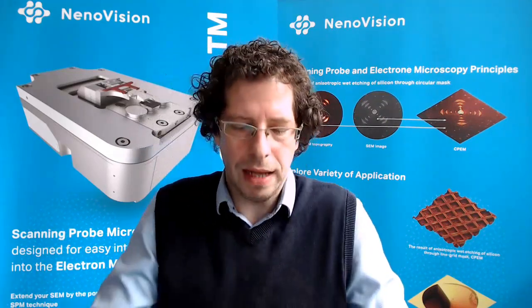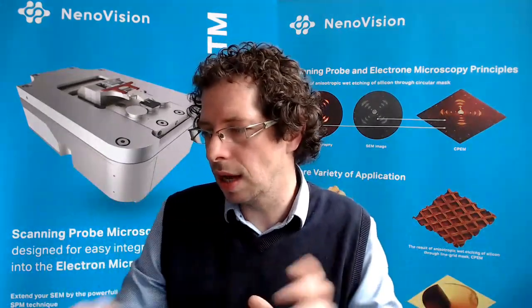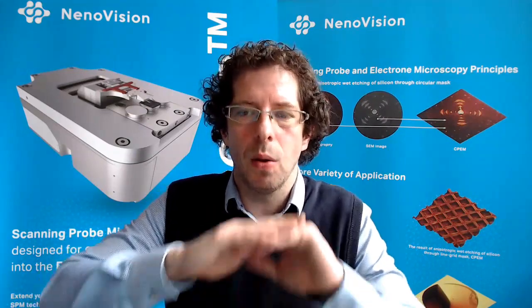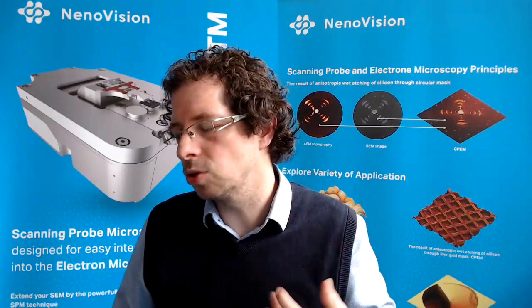The sample might be larger, but the scannable area is 2 by 1 centimeter. Regarding weight, a heavier sample usually means you should scan slower. The speed has to be reduced, and to not destroy the scanner, we say 100 grams, which I would say is quite a lot.